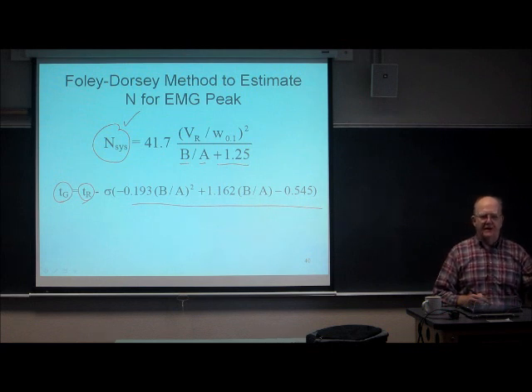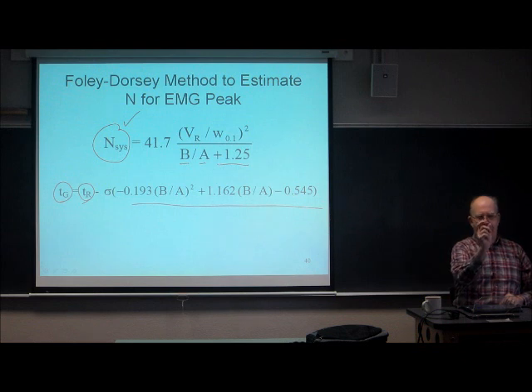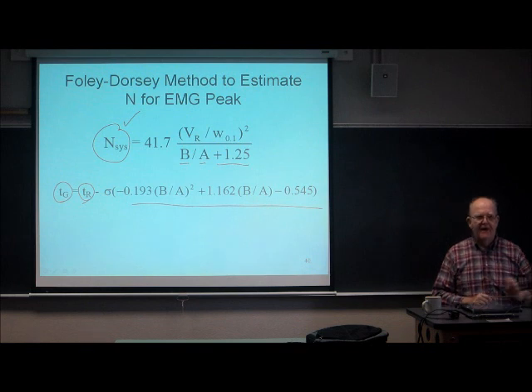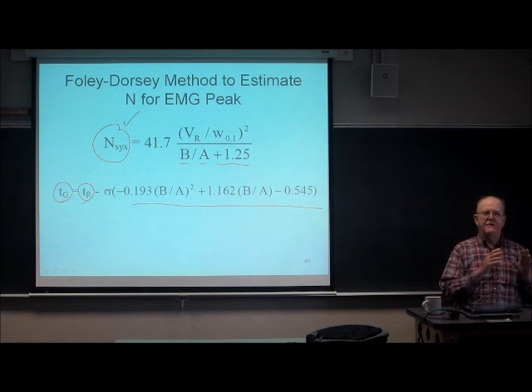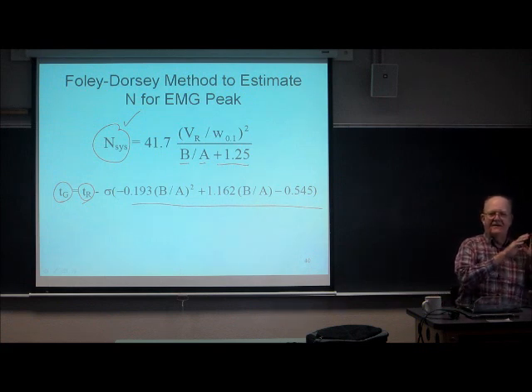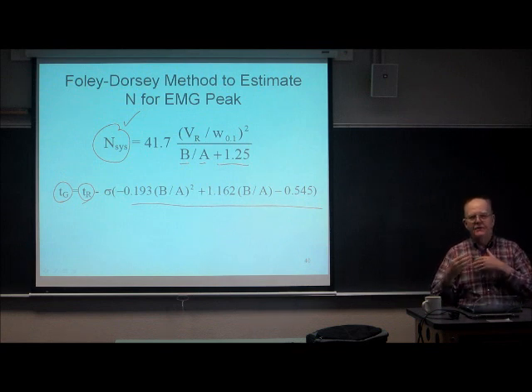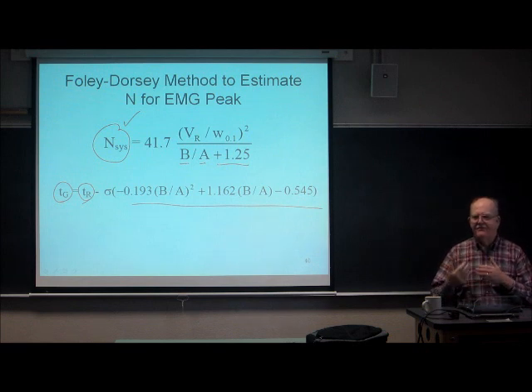If you don't override the algorithms, it's going to measure the half width of the peak. It's going to pop that into the Gaussian formula that I just showed you on the previous slide, and you're going to get a plate count. And it's going to be wrong. However, I also don't know of any data systems that you cannot override the default algorithm and tell it how, it'll give you a number of options as to how it would evaluate the true plate count.